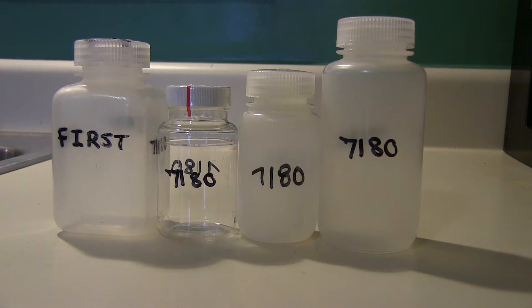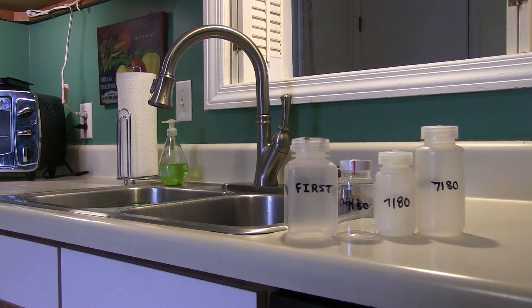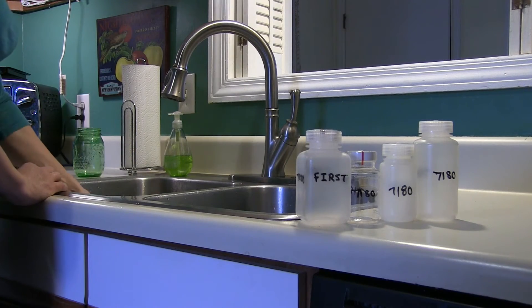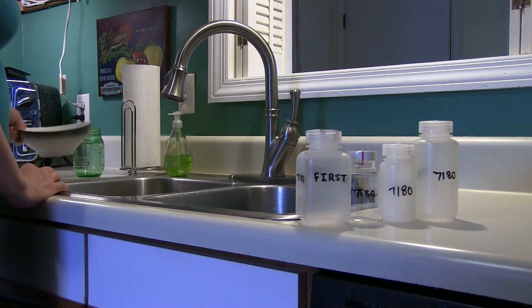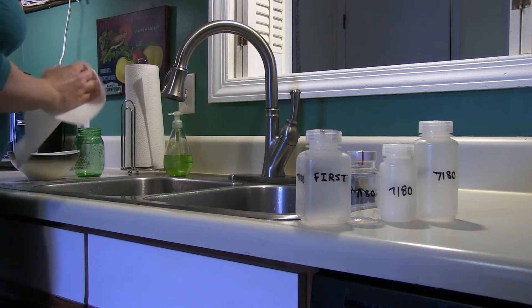Water collected in four sample bottles is analyzed for 14 parameters. Choose a cold water faucet in the kitchen or bathroom to collect your samples. If you drink or cook with your water, collect from this faucet. Remove all dishes and other items from the sink and wipe out the sink to minimize splashing. Do not remove any screens or aerators from the faucet.